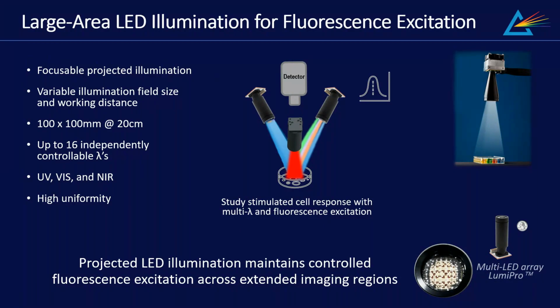In this example, independently controlled wavelength channels spanning ultraviolet, visible, and near-infrared regions can be combined or operated separately depending on the imaging or excitation requirements. The ability to electronically select these wavelengths also enables flexible fluorescence excitation strategies and dynamic imaging sequences without requiring multiple independent light sources or mechanical switched filters.